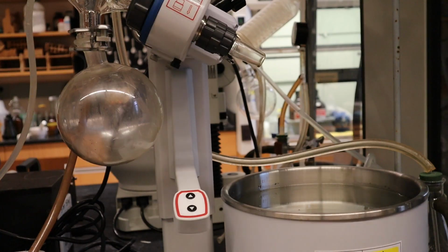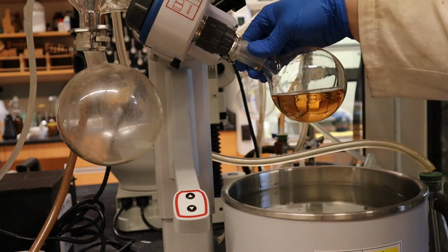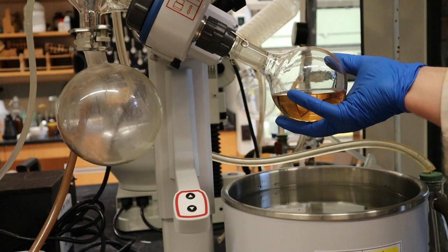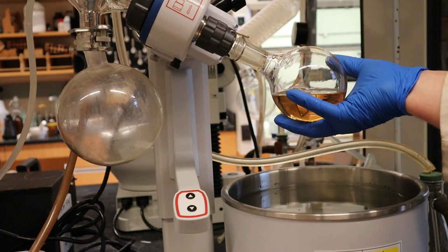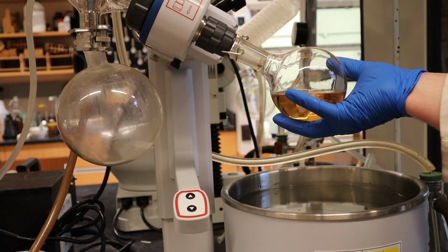I used a rotary evaporator, or rotovap, to remove the solvent. A rotovap applies a vacuum to the mixture while heating it gently, which results in rapid evaporation at a relatively low temperature. The rotation of the flask increases the surface area available for evaporation and reduces the risk that the solvent will suddenly boil and spray into the condenser.